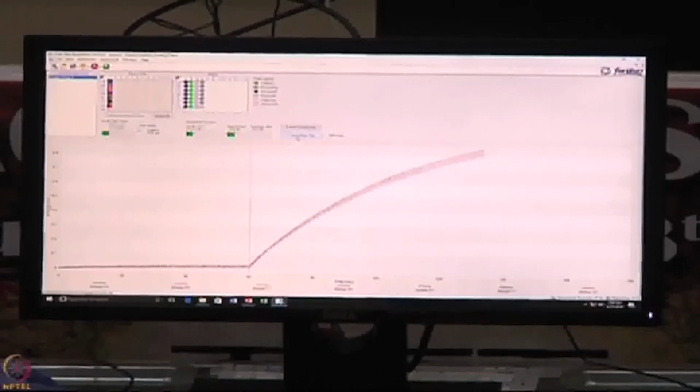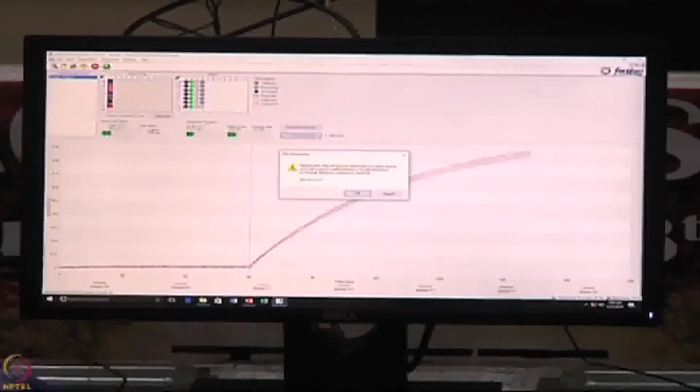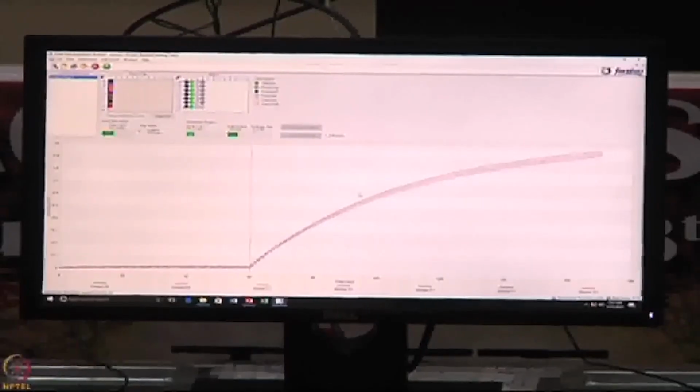What's the affinity constant range that this works well in? From 10 picomolar to 1 millimolar you can go. That is broad, on par with your Biacore. So that's good enough for me, I think, loading. One nanometer. Okay, fine. I'm going to the next step. It's good enough for me, the immobilization level.